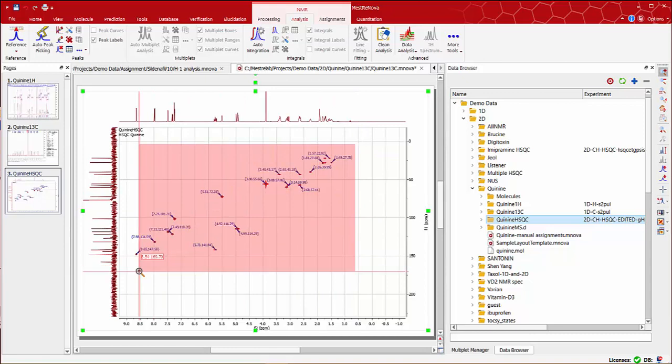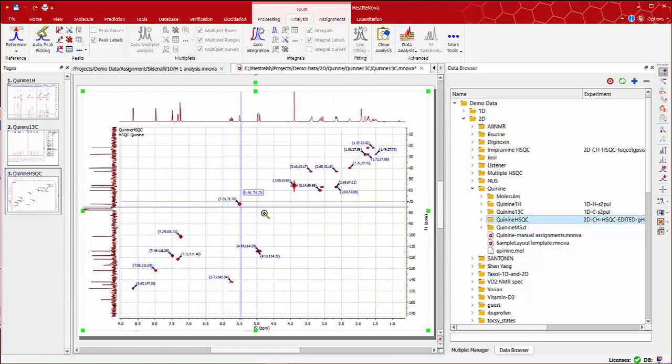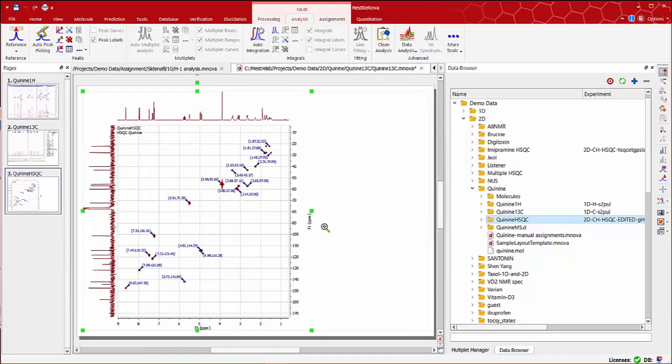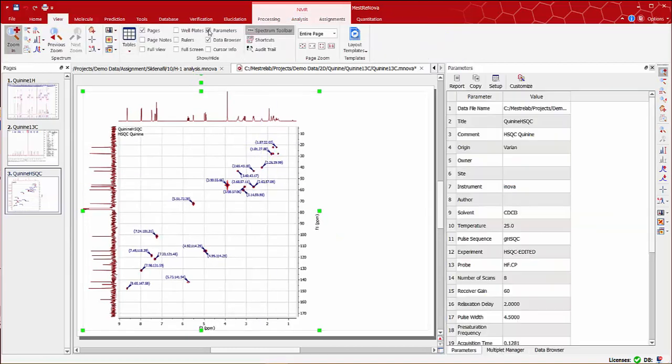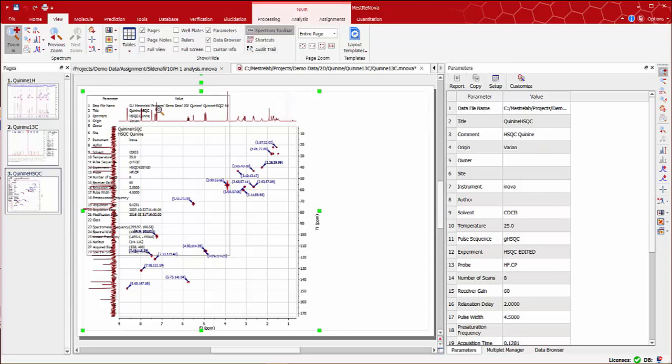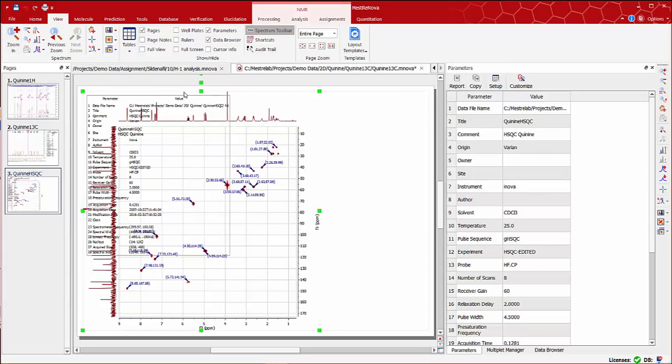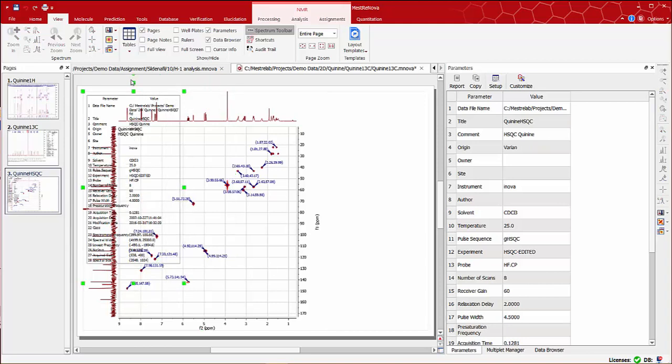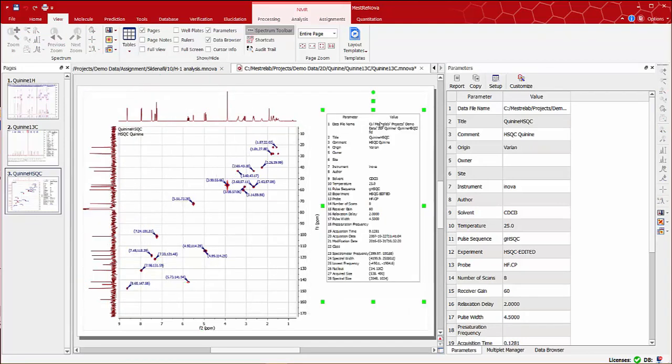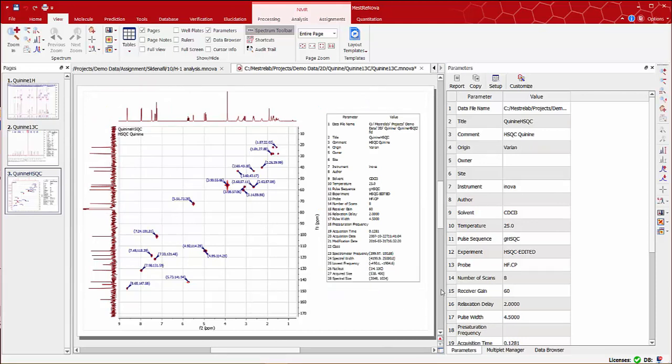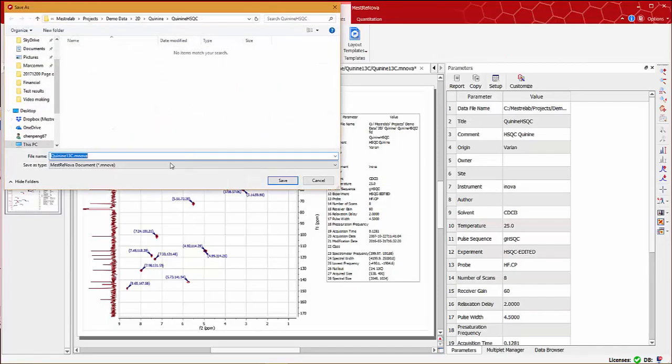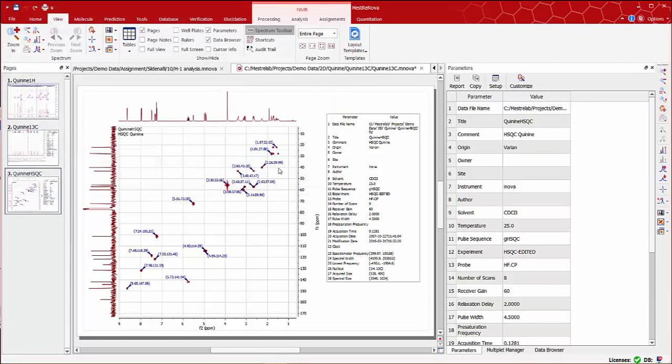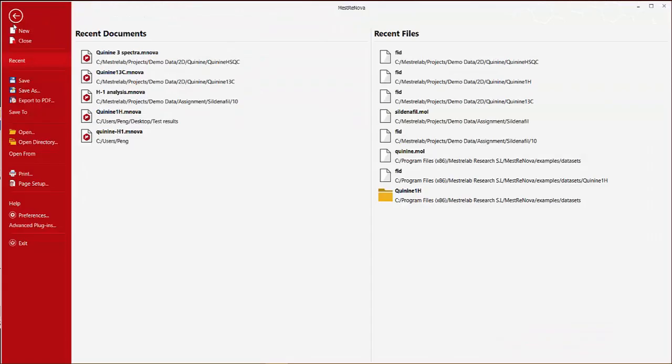Now we can report the analysis results. To do this, just resize the spectrum, go to view parameters, and click on report on the parameters table to display the text box with your experimental parameters. Finally, as in our previous clips, we can save all these spectra in file save as an MNOVA document or report it as a PDF file.